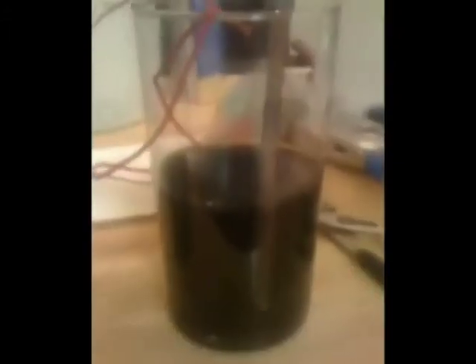Okay, this is after about 2 hours. You can see that the copper is really starting to build up on this. I've moved the electrode a little closer to the copper anode just to see if we'd have a better reaction, and we do, and the copper really is starting to build up faster, which means this is working perfectly.